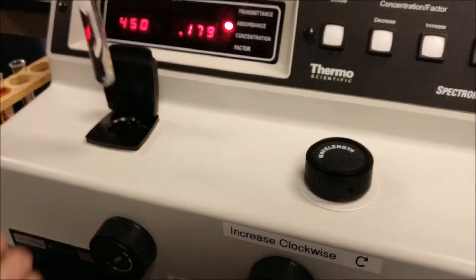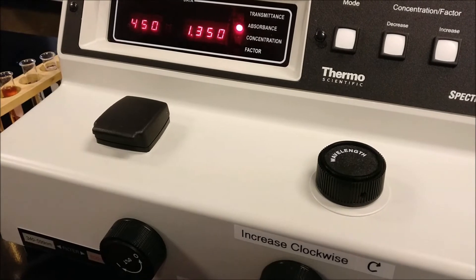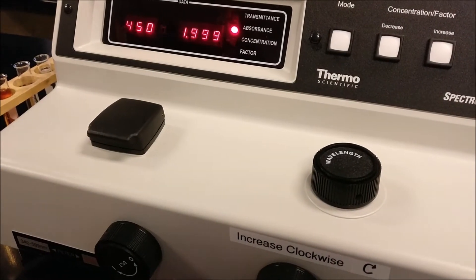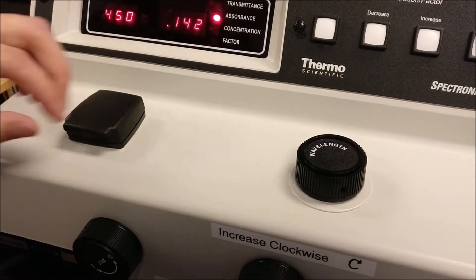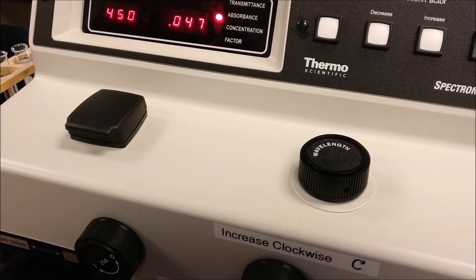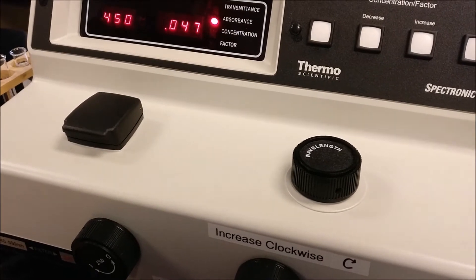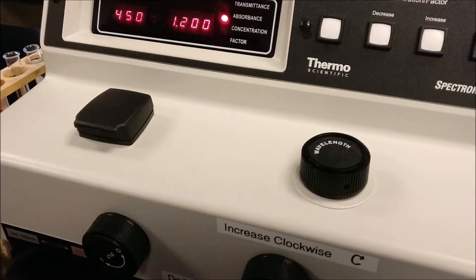Take out the water test tube from the sample holder. Close the holder and the absorbance should go back to 1.999. To test the absorbance of the first sample, place the test tube with the white label towards you into the holder. Wait for the reading to stay constant and record the number. Repeat the process for the remaining three test tubes.